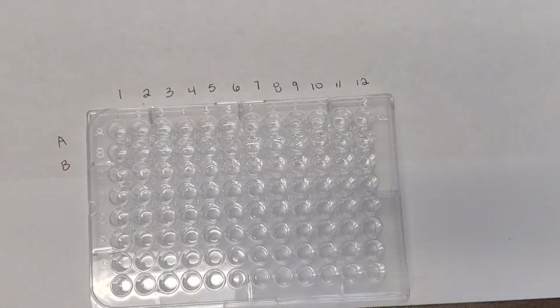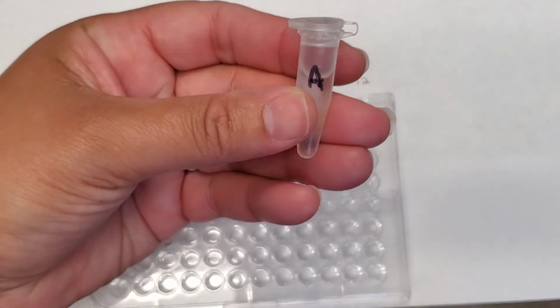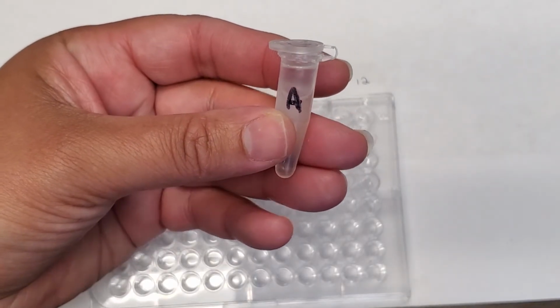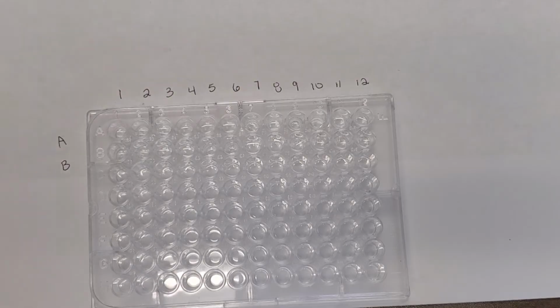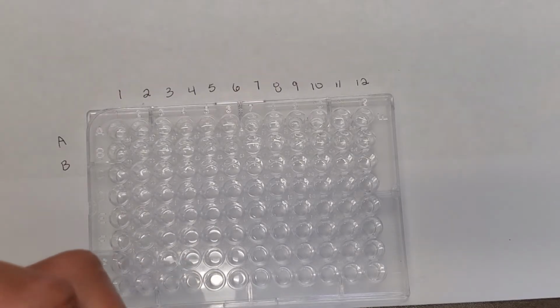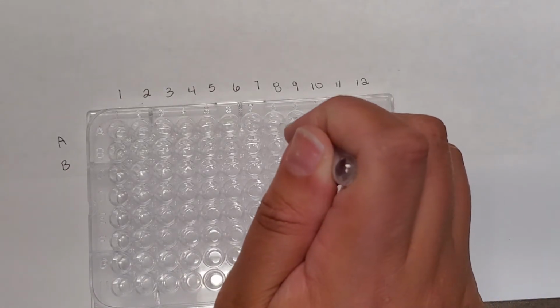Once we're done with our positive and our negative controls, we are now going to start working on our patients themselves. So our first patient, this is a patient we're testing. It's patient A. We don't know whether they actually have been exposed to the disease-causing organism or not. So now we're going to add 3 drops into wells A7 through 9.